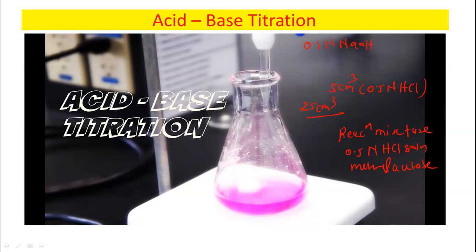To neutralize the acid, we have to add the NaOH solution from the burette drop by drop. The color change will be from colorless to pink. You can see here the color change, colorless to pink. So this is our first reading.